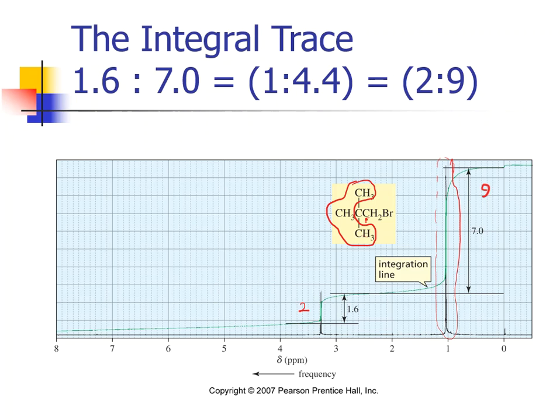So look at your numbers. They will always be provided. These numbers will always be calculated by some type of software. They'll be given to you in example problems. Use those numbers, divide by the smallest. Almost think of empirical formula back in general chemistry. And then if you get a weird oddball one, then use a multiplier, a 2, a 3, a 4, or something in order to get it closer to a whole number that you can round up. If we're within like 0.1 or 0.2, we're okay with that. We round it up, okay?